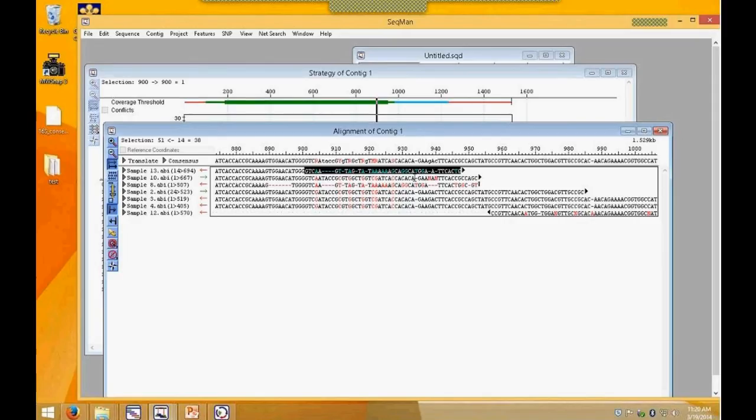We also see this in NGS projects. So not so much the Illumina genomic data, but where we see these kinds of contaminants are things like transcriptome data, where there may have been a cDNA library kit or something where some primers, linkers, adapters are untrimmed and on the ends of the sequences, right? And they show up just like this, and then having millions of reads that have linkers like this causes a more inefficient assembly and lower quality and all that sort of thing. So you want to trim back, identify problems, and trim them, and then go through all the steps of editing.